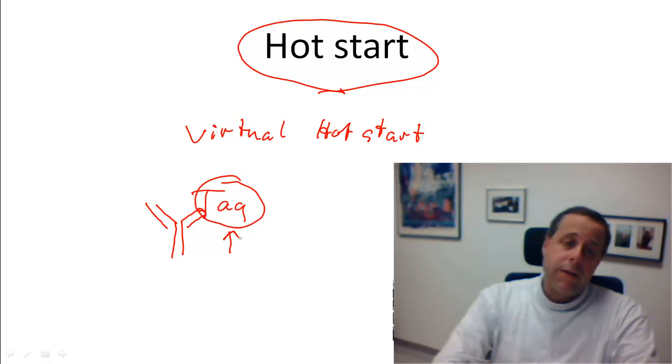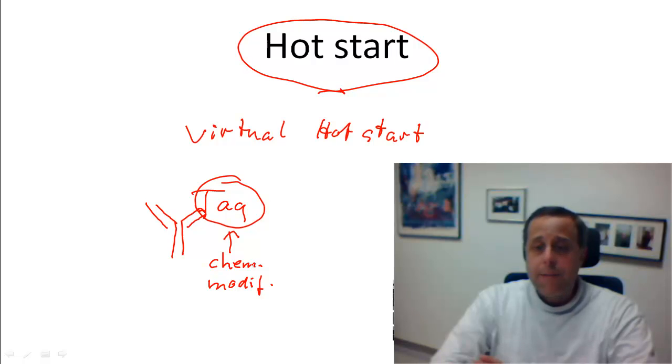The same idea holds true for temperature sensitive chemical modifications. Chemical modifications. Those would again come off at the high temperature of the first PCR cycle and then allow Taq polymerase to do its job, but not before while you're setting up the reaction.